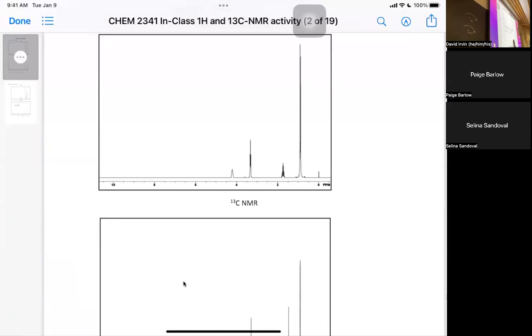Is it only in carbon? Only in carbon NMR, because see how noisy the baseline is? In proton NMR it's much cleaner. So even though it's less than 1 inch, that is a peak, and that's a peak. And that's our zero. That's our internal standard. Okay.